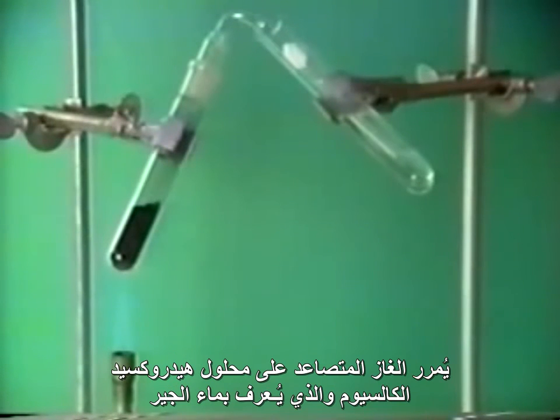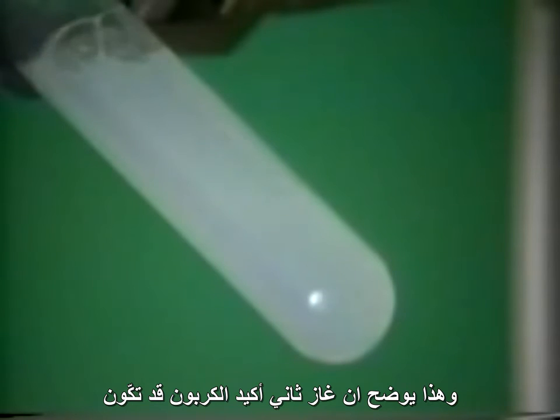The gas evolved is passed into a solution of calcium hydroxide, that is, lime water. Notice the white precipitate of calcium carbonate formed as the evolved gas passes through the lime water. This shows that carbon dioxide is produced.